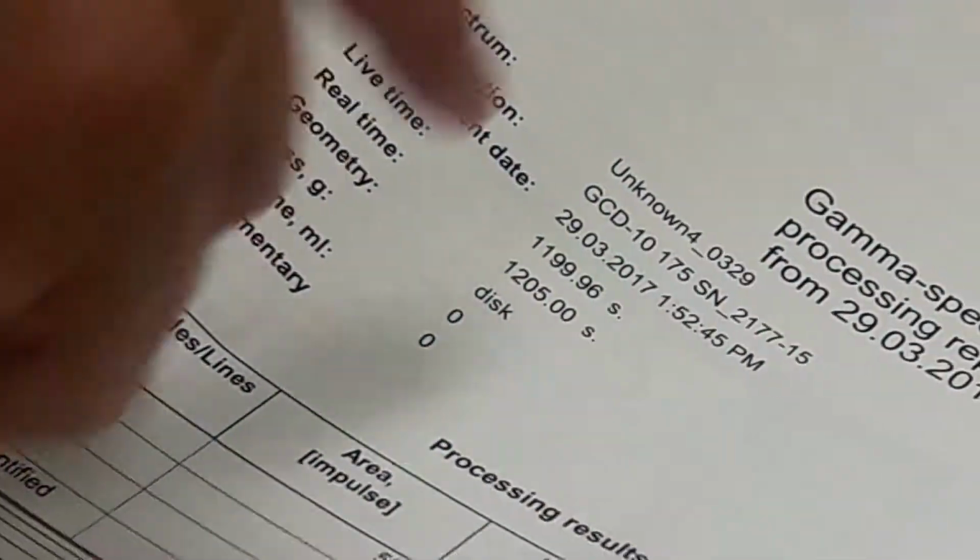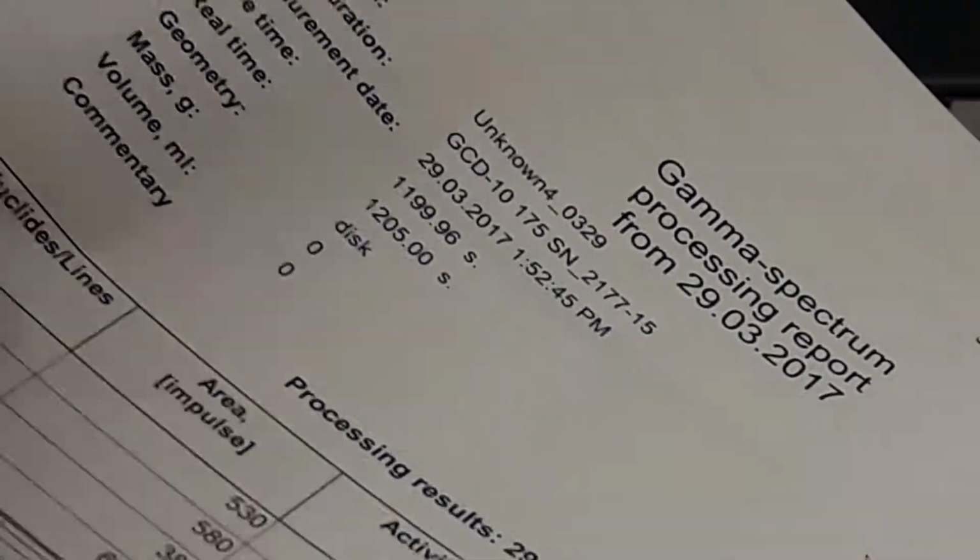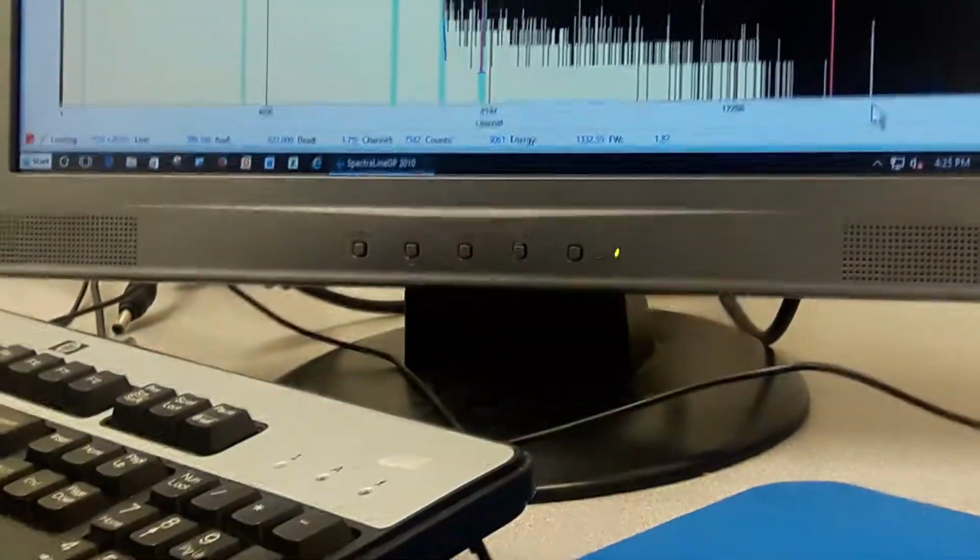And what's also very important, the separation of this date is through dots, not slashes. And we have to make sure that the date format in our computer matches the date format for this particular software.